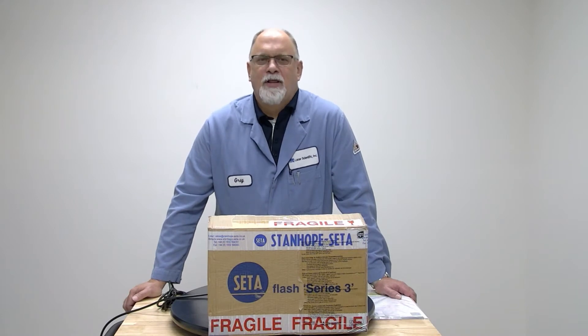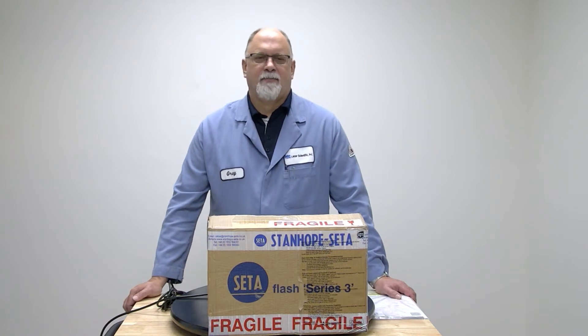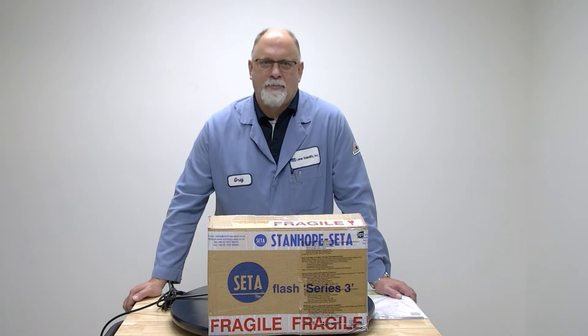Hi, I'm Greg Lazarczyk with Lazar Scientific, and welcome to another edition of Flashpoint Fridays. In this video, we're going to discuss the setup and overview of the Setaflash Series 3 Active Cool.